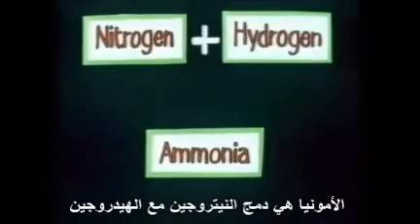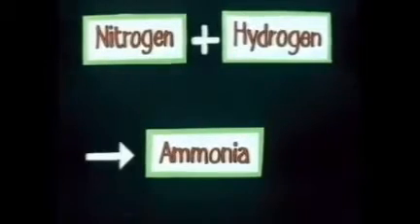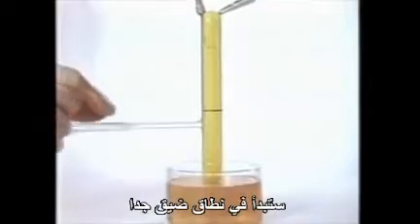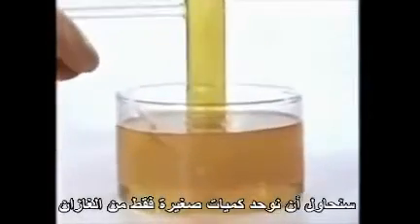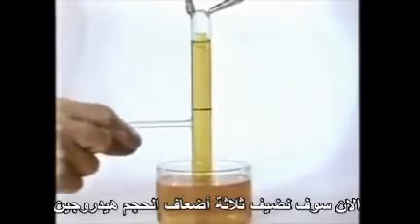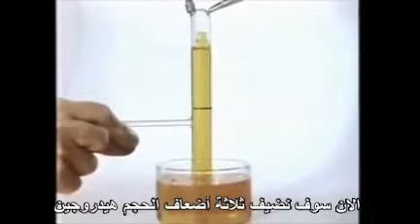Ammonia is nitrogen combined with hydrogen. We'll start on a very modest scale and try to combine just small quantities of the two gases. This is nitrogen being bubbled into an upside-down test tube. The liquid is a dilute acid containing a chemical indicator. Any ammonia we make will neutralise the acid and cause the indicator to change colour. Next, we add three times the volume of hydrogen.